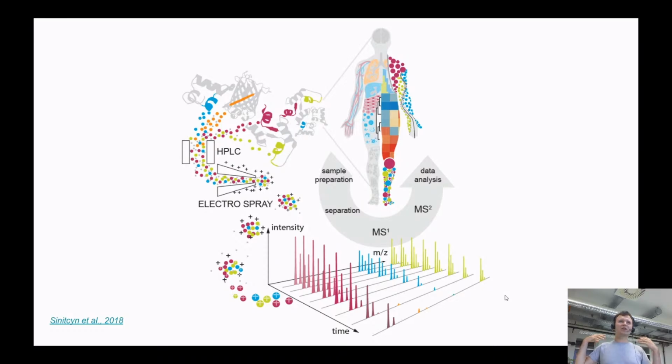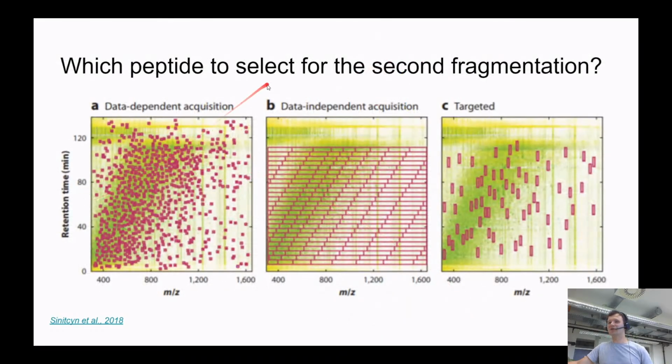But we're saying, okay, let's select the top 20 by intensity, and queue them for selection, fragmentation, and measurement. As a result, all the rest, 980 milliseconds, we're spending on actually analyzing this top 20 peptides. But it's actually what it usually looks like.